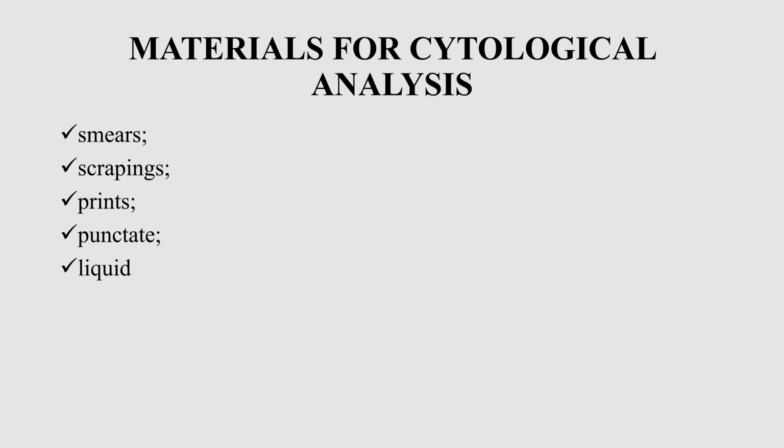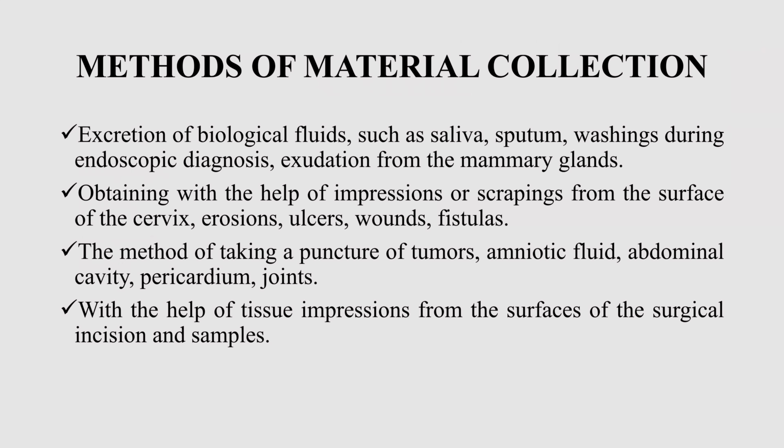This method is used in some respiratory diseases because of sputum or other fluids from the respiratory system. It's easy to prepare these impressions or scrapings.